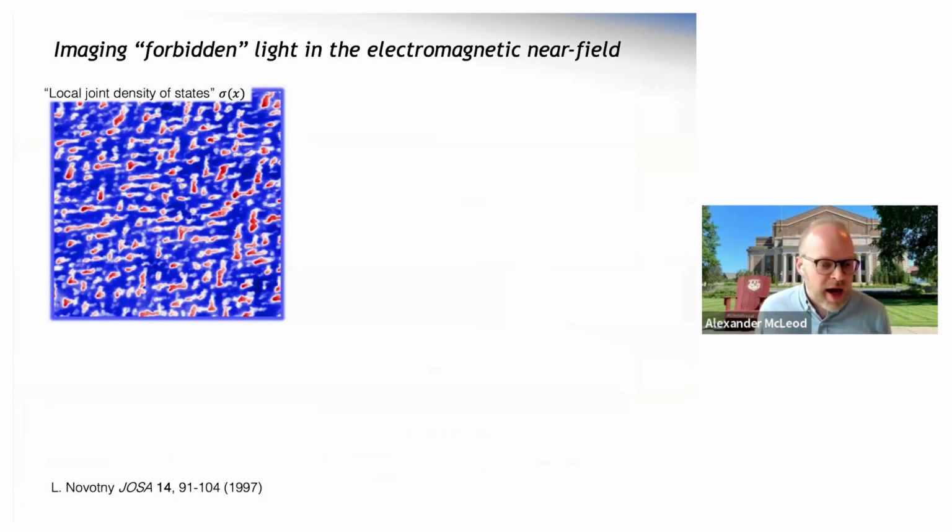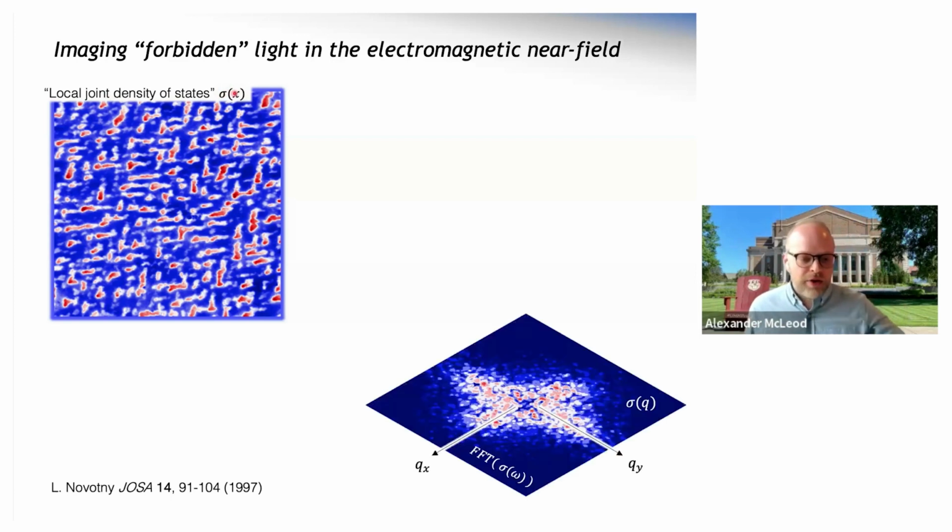And in some regions, we have the phase that we want. And in other regions, we have the competing phase. So this map of optical conductivity tells us which phase is which inside the material. So this is the conductivity, sigma, which is a function of position. But I'm going to do something funny for you.